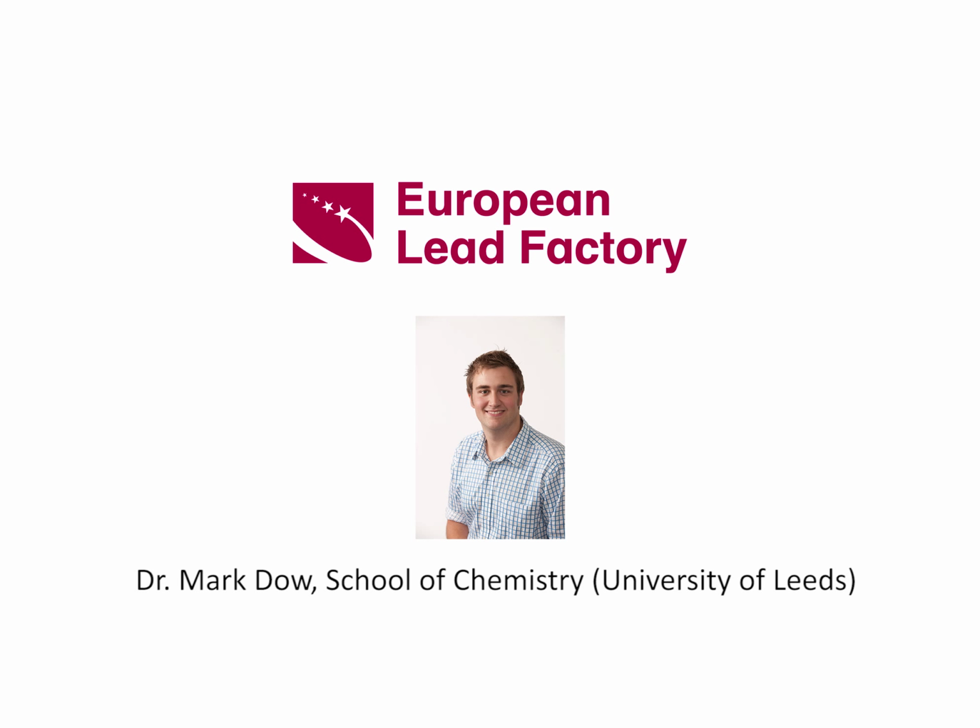I'm a postdoctoral researcher at the University of Leeds, and I'm going to give you a quick demonstration on how to use the European Lead Factory web tool to submit your chemical proposal.